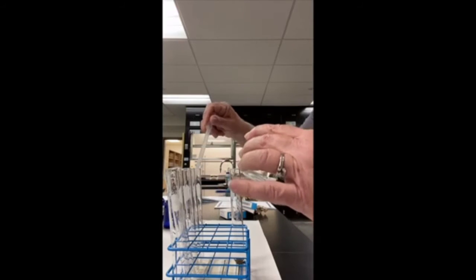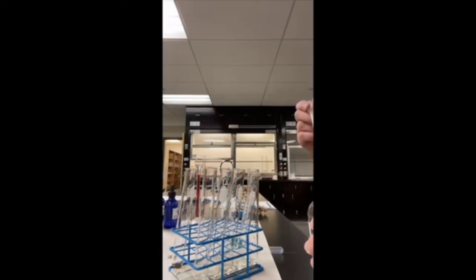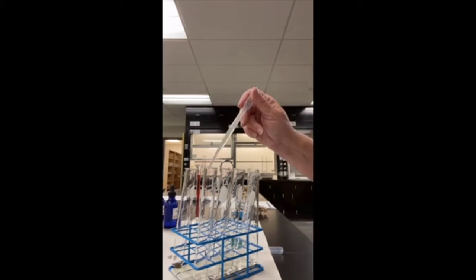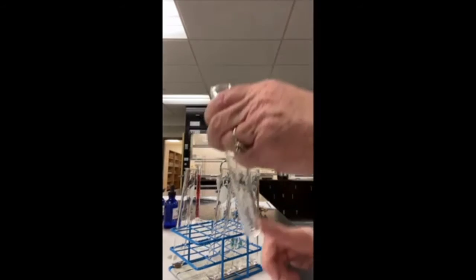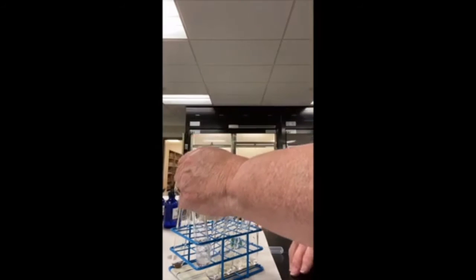And it looks like we did good. All right, I'm going to add a few more drops than the directions said. The directions say to add 2 to 3, but I'm going to add about 7 drops. So I added my benzaldehyde to the first one. It has a beautiful aromatic odor, as we know benzaldehyde should. So I'm going to mix that and then let that set.